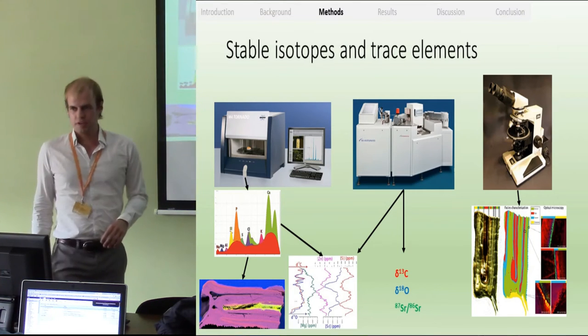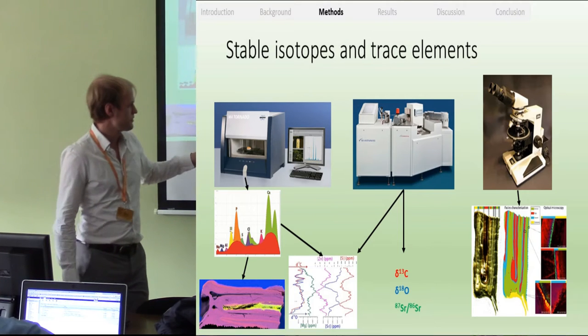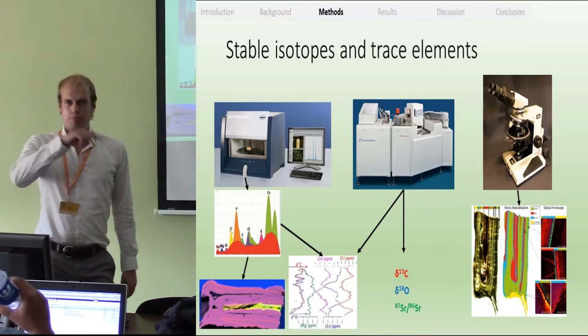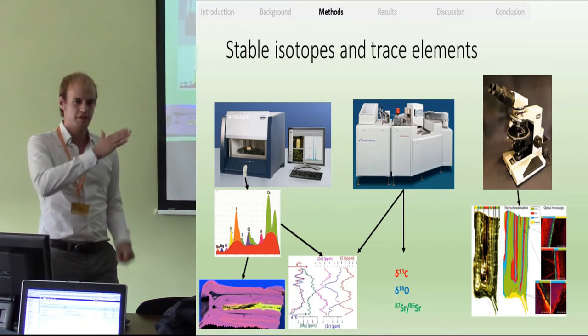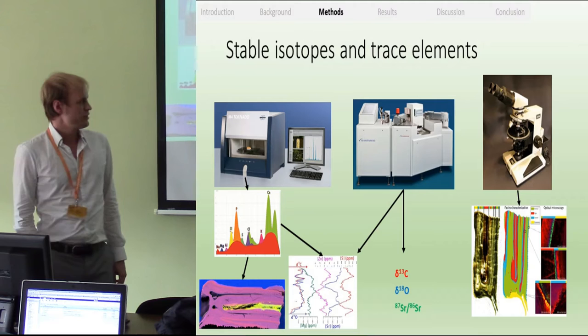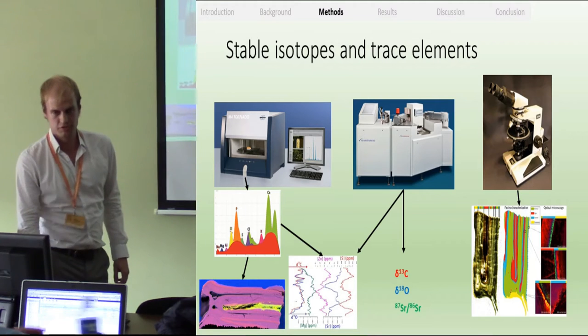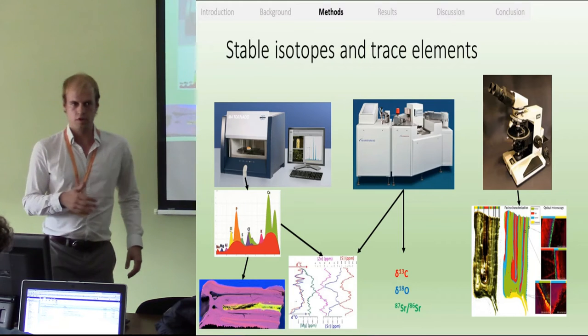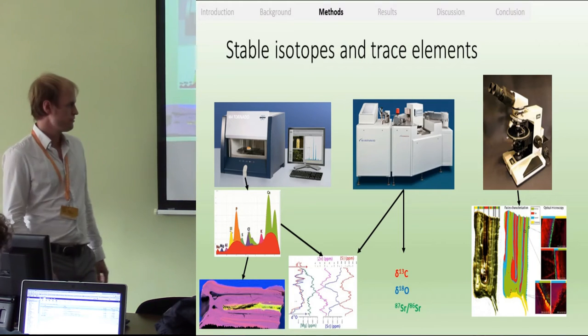What I'll present here mostly are these profiles, which are a bit hard to see when you see more of them, that we do through the growth direction of the tooth, measuring different trace elements to see what they show and how they relate to the isotope profiles that we have in the same teeth.